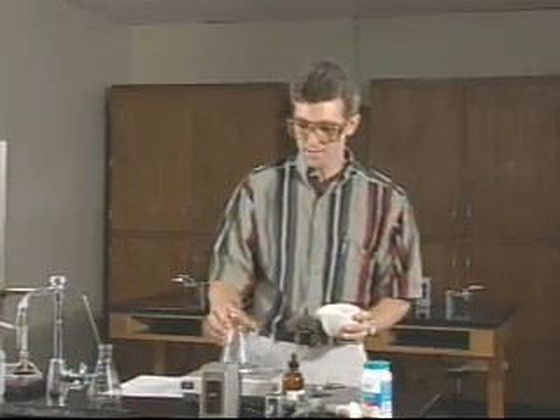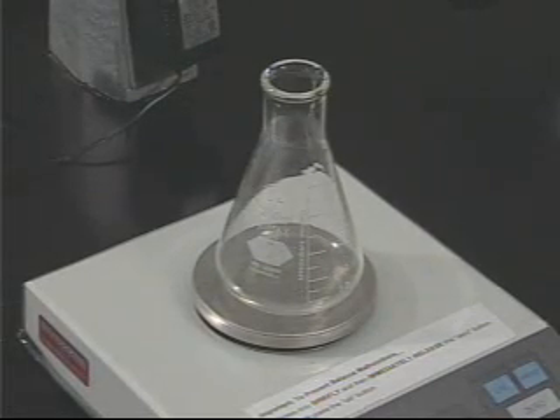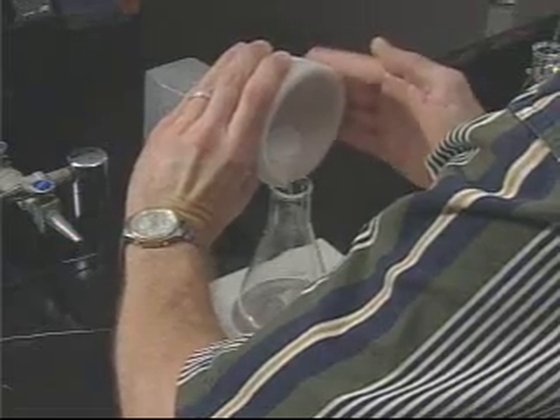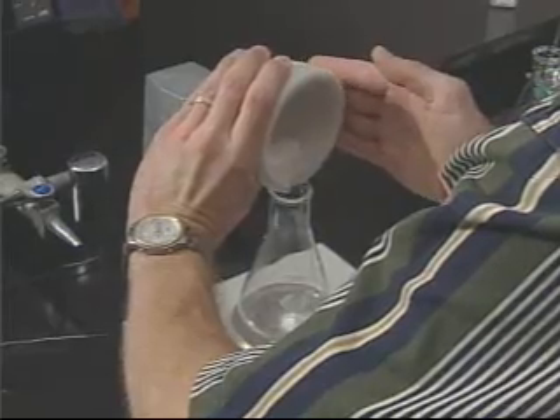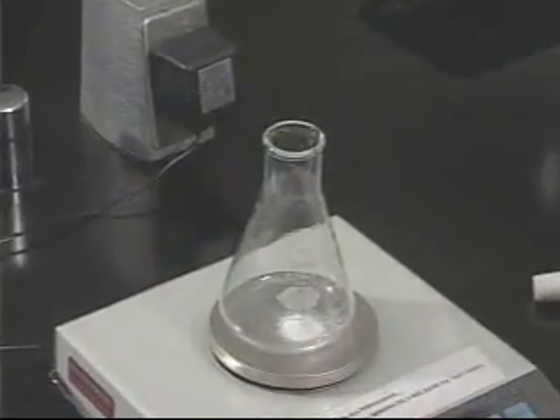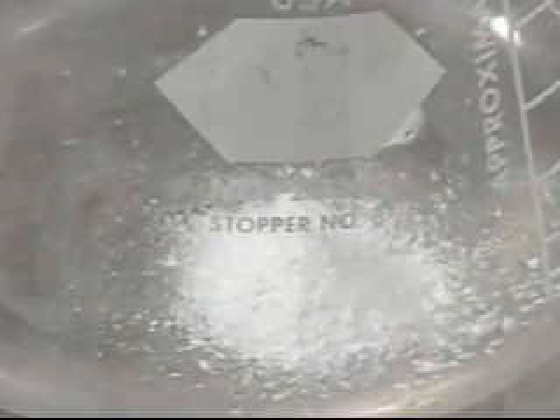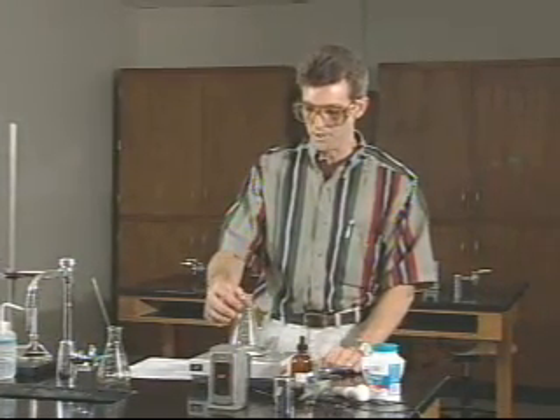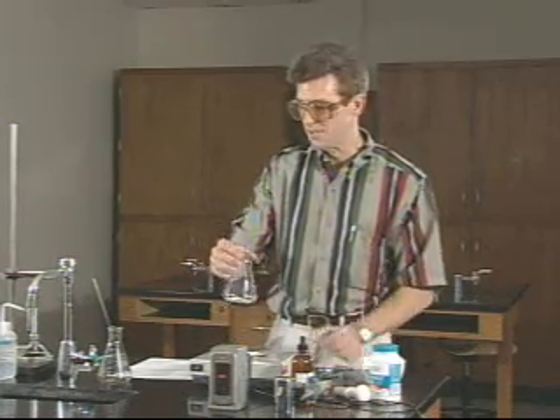Now we need about half of this tablet for the analysis, but no more than 0.5 grams. So we're going to start by taking a flask and weighing the flask — write this weight down on the report sheet. Then we're going to take about half the tablet, but no more than 0.5 grams, so you may want to watch the scale as you do this. We have a new mass, and we will write that down on the report sheet as well. The difference between that and the previous reading is going to be the amount of antacid substance we have.